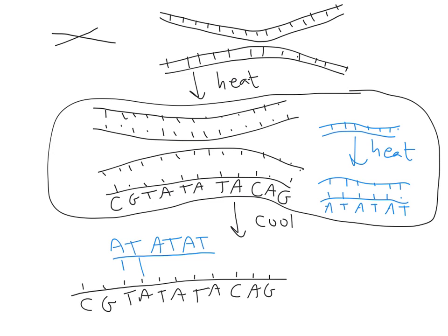And so it will base pair with the chromosome. And now you have a blue fluorescent molecule that's giving off blue light when we look at it under the microscope. And that's how we actually visualize where in the genome that probe sequence is found.